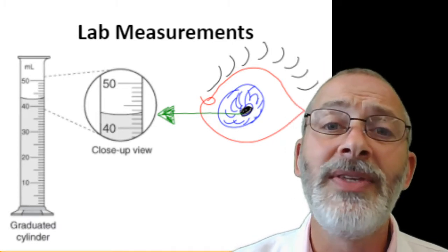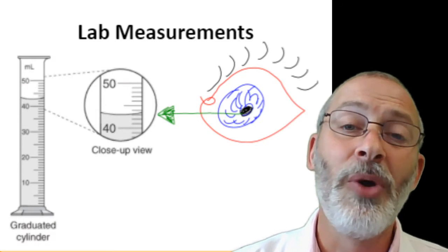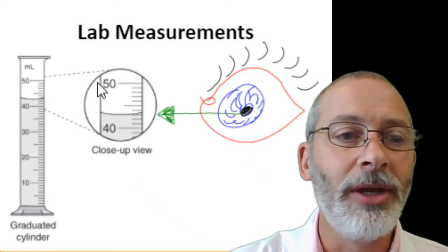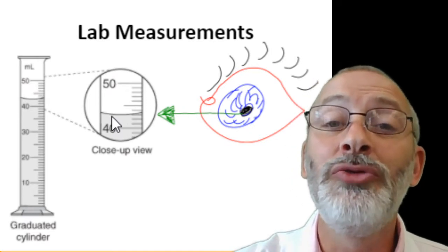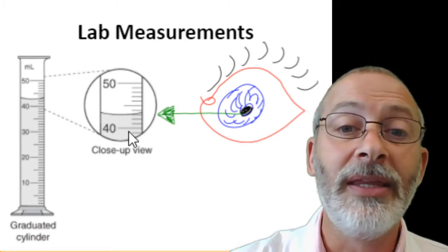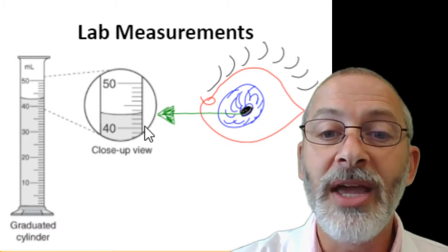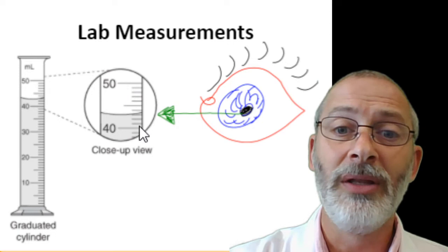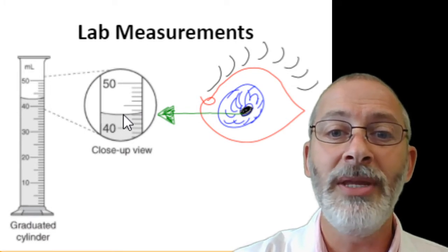Another important thing to keep in mind is that your graduate must be placed on a level surface like your tabletop or your sink counter, because if you're holding it at an angle, the meniscus is going to move. Looking straight at the level of the liquid inside the graduate, we're going to read this the same way we read a ruler. Here's the liquid — the gray part. Here is 40 and the units are milliliters, so this line is 40 milliliters, and this line here is 50 milliliters.